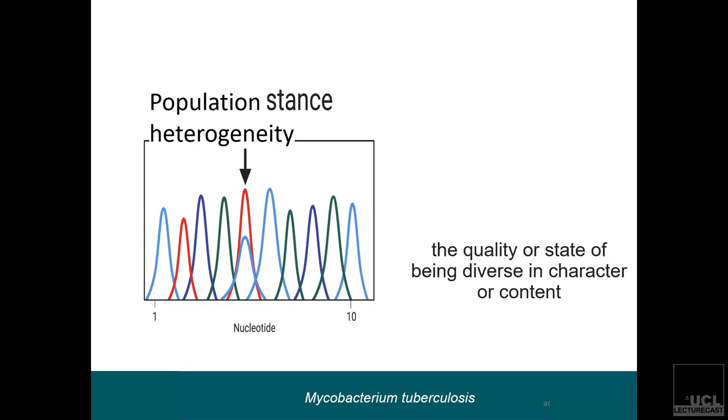One of the advantages of Illumina-based sequencing is this: under UTH, TDRC, and CDL, each patient who is rifampicin resistant, from the time they're determined, samples are sent to us on a monthly basis. And we do cultures to see whether the treatment is working or not. So you can have some months where it's working, and then month four, month five, resistant, phenotypically and the like.